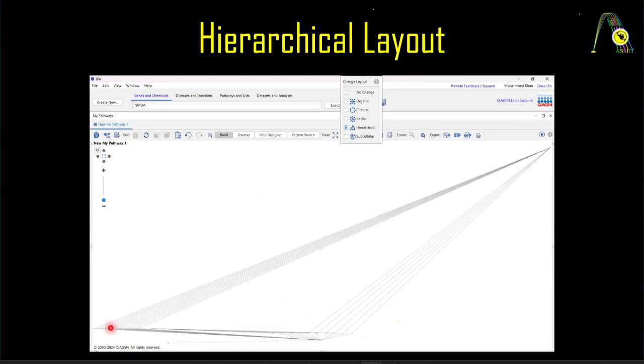So you can see the different molecules / nodes are very far apart, and it's quite impractical, right? But I've included it just to show you that oftentimes the layout options are not practical. At the end of the day, arranging it the way that you see fit is what you should be doing. Again, it's about how you want to fit it into your research, or how you want to assort the different nodes in your pathway, right?